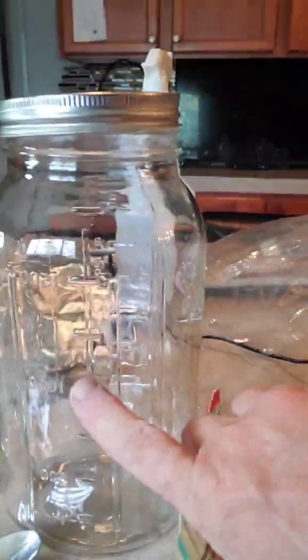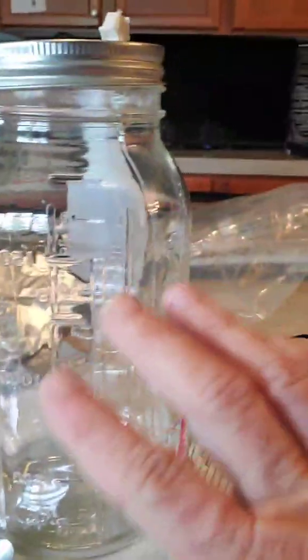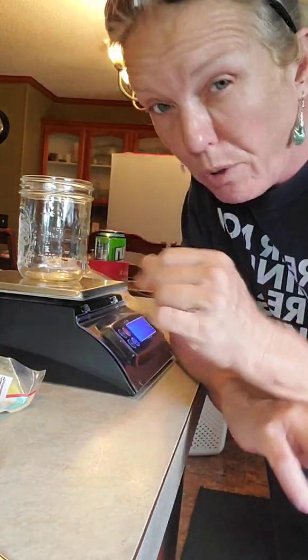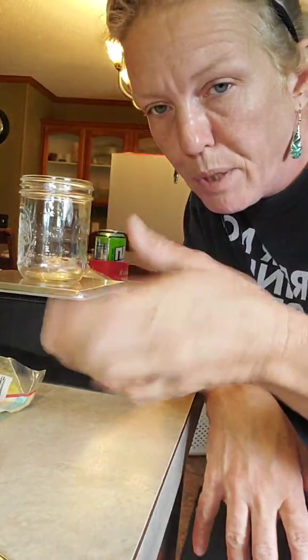Again, we're on grams. Everything, when it comes to agar, is measured in grams and milliliters. We're going to need 1,000 milliliters of water. Actually, I'm doubling this, so I'm going to be using 2,000. You guys are only going to be using 1,000, because for pouring plates, a 1,000 milliliter recipe will usually pour about 30 to 35 plates.